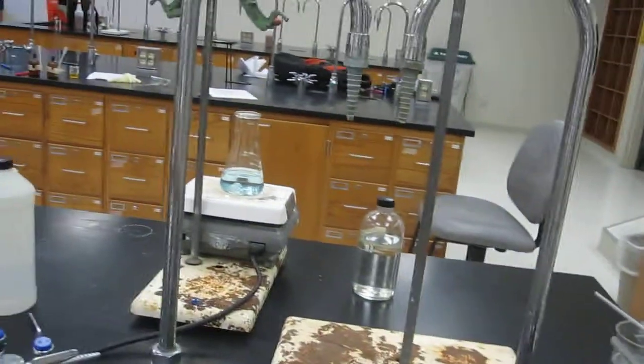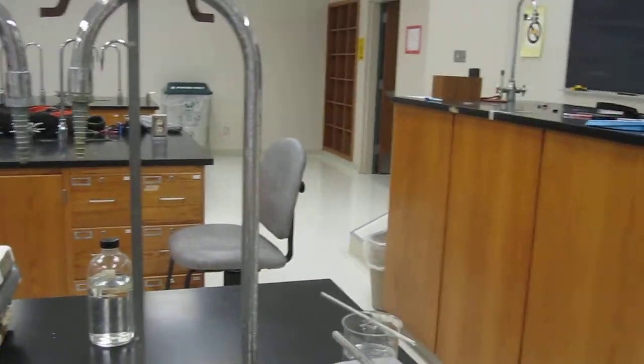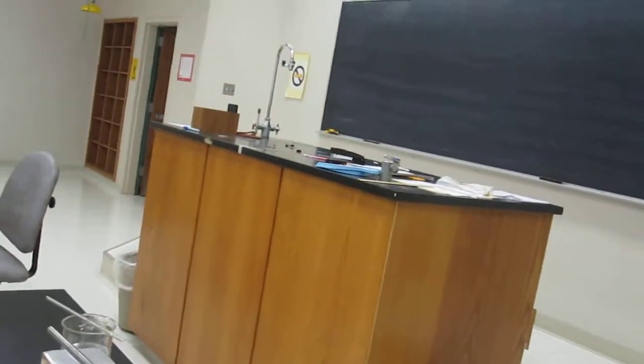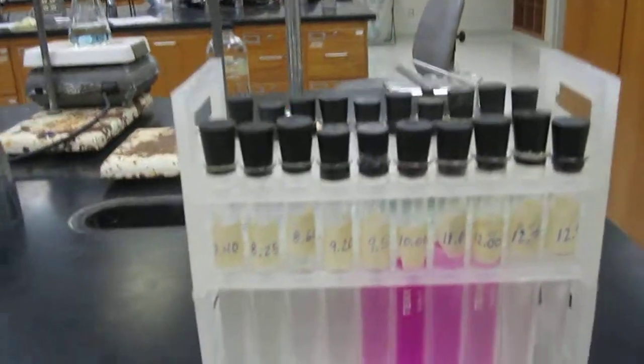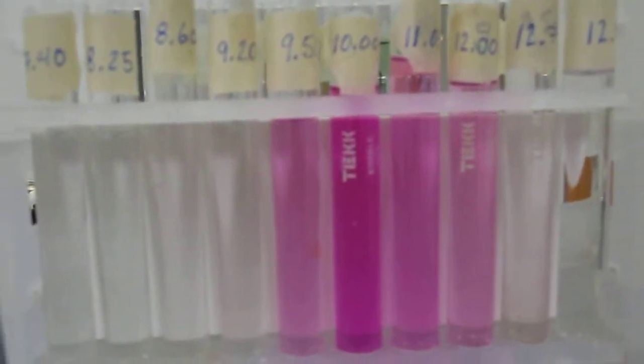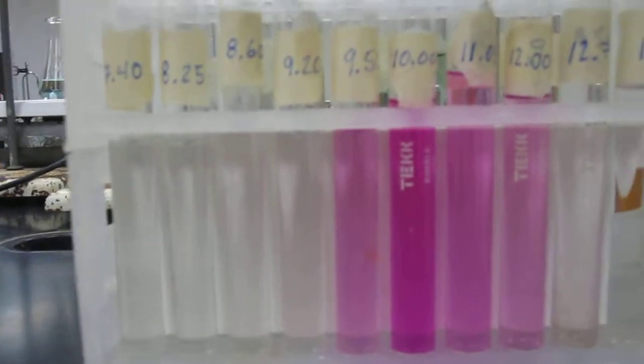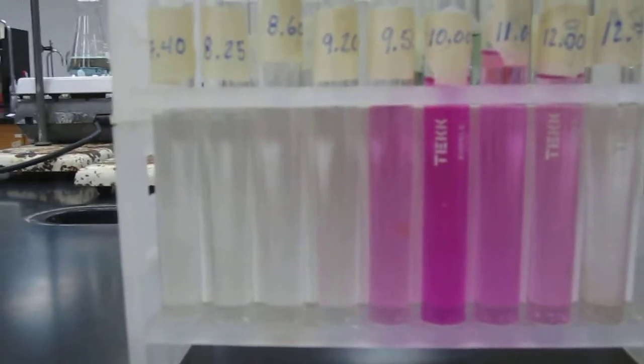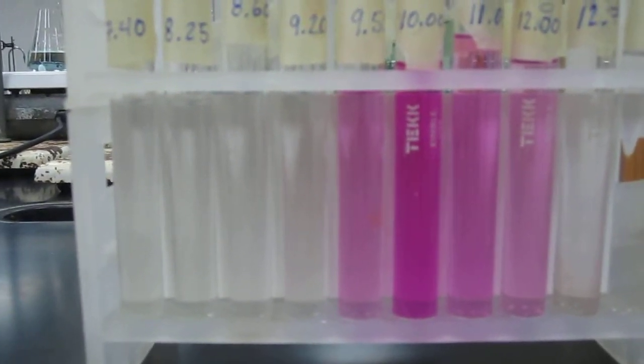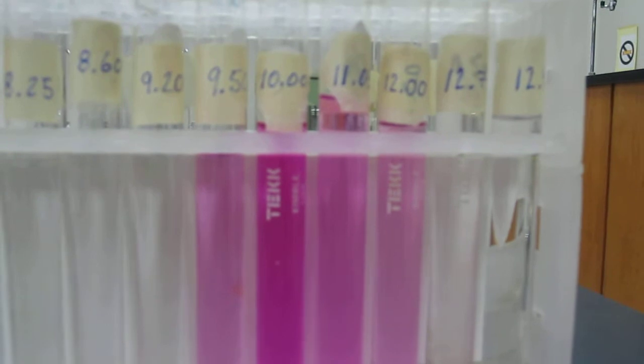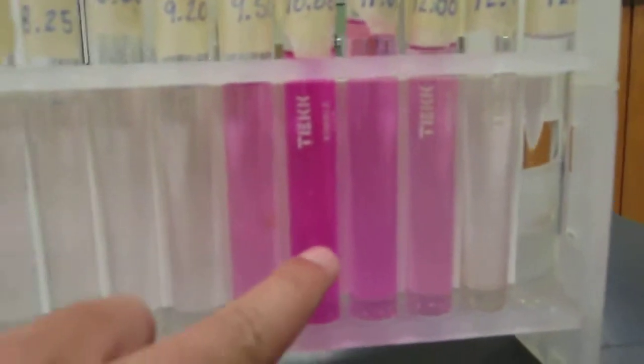And then the last indicator, indicator C that you'll be using is going to be phenolphthalein, and you're going to be using this in pH range 8 to 10. And you can see that in that pH range, it turns from colorless to what's known as fuchsia or pink. And then you can see it actually at 10 is really dark pink.